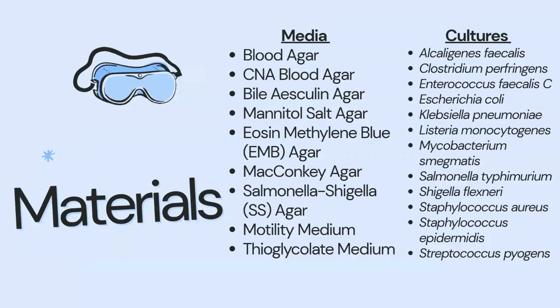Our cultures are Alcaligenes faecalis, Clostridium perfringens, Enterococcus faecalis, Escherichia coli, Klebsiella pneumoniae, Listeria monocytogenes, Mycobacterium smegmatis, Salmonella typhimurium, Shigella flexneri, Staphylococcus aureus, Staphylococcus epidermidis, Streptococcus pyogenes.